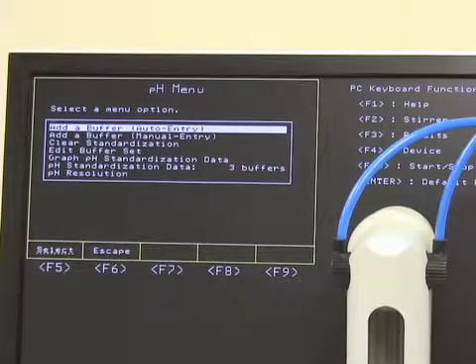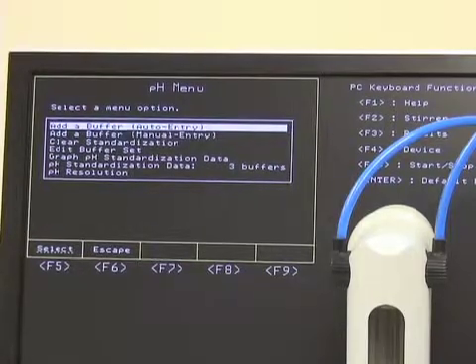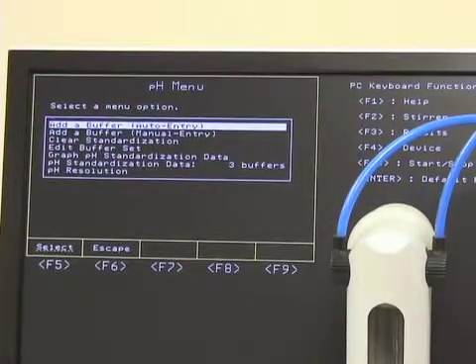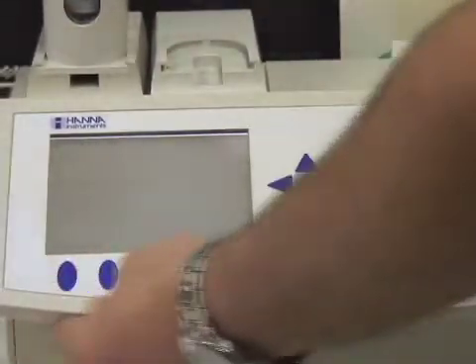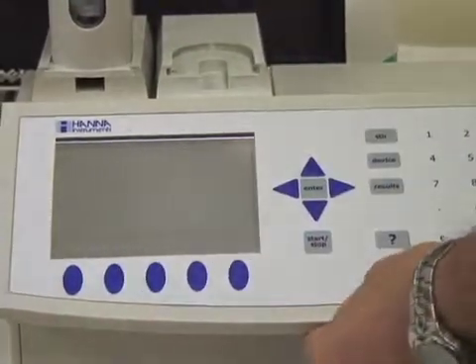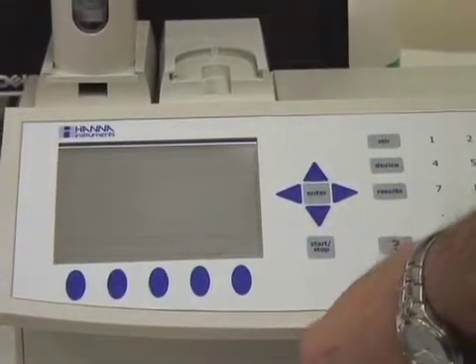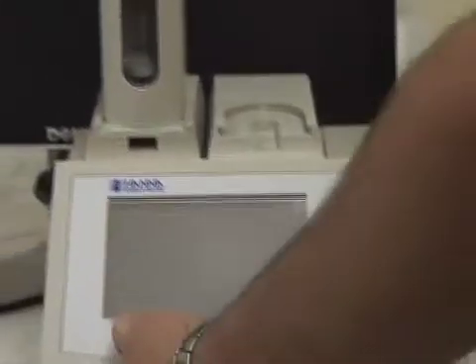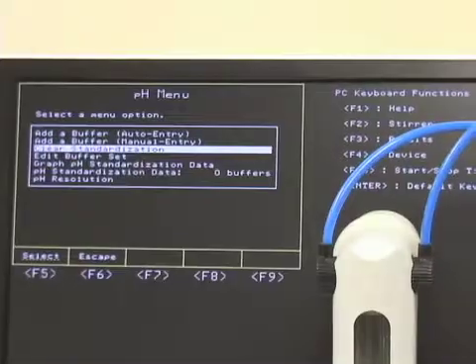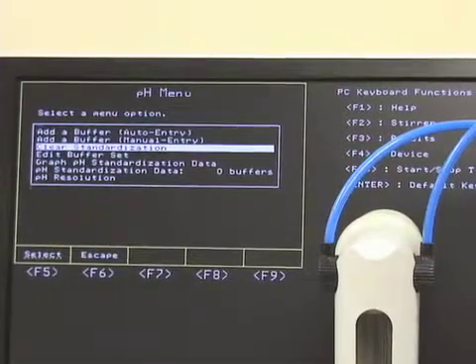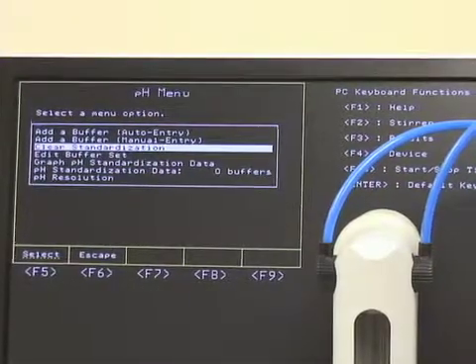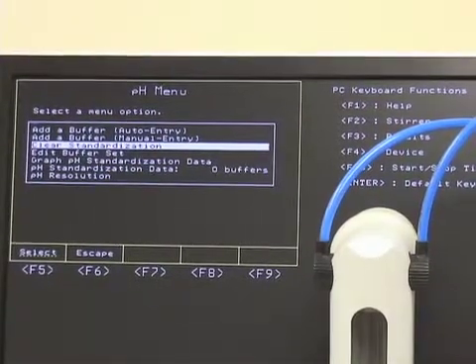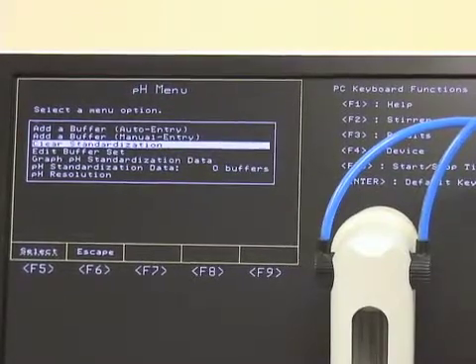We're going to start by clearing our standardization data. Scroll down to clear standardization data and hit select. It'll ask you if you would like to clear it — hit clear. You'll see now there are zero buffers under pH standardization data and no entry points at the moment.